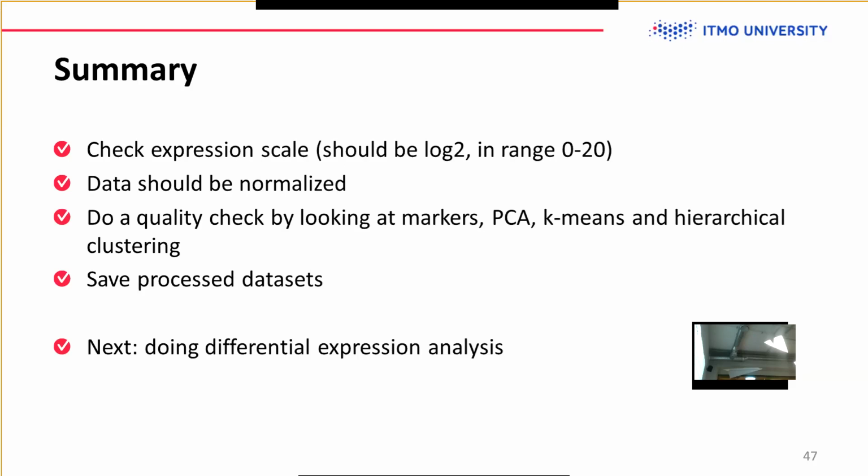There was a question if there are metrics for identifying outliers, and well, people work on this. There are some methods. However, mostly they're in a statistical sense. You get a distribution, and if it's more than 3 sigma, then it's an outlier. However, biology is very weird.